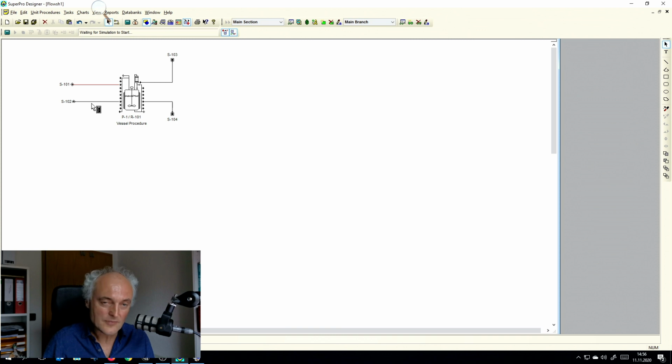Now we set up the vessel operations. At present, we just have a picture of this vessel, but at the end, what we want is to proceed in this vessel with a reaction. So we need to tell what should happen there. We need to add operations to this vessel. We need to bring these things in, these things need to react, and then these things need to get out. These are the operations we want going on in this vessel. So we just add operations.